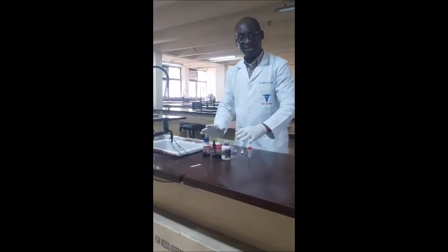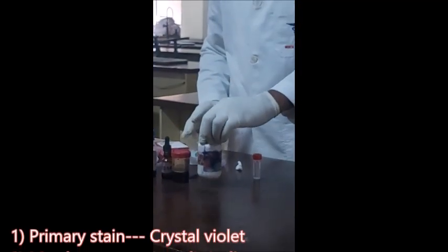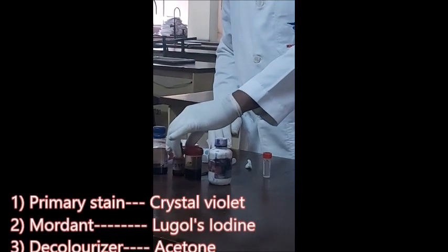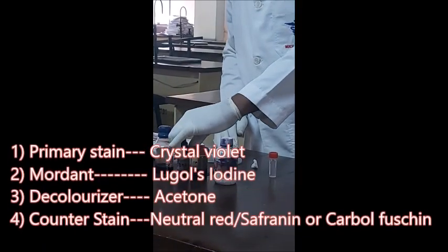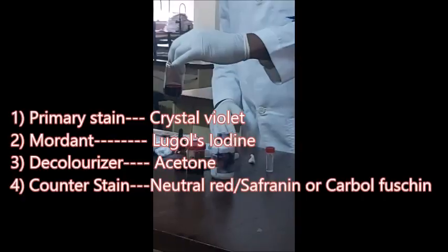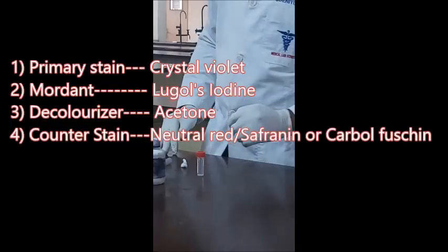The stains we are going to encounter in the Gram stain technique are: the primary stain, which is crystal violet; the mordant, which is Lugol's iodine; the decolorizer, which is acetone or alcohol-acetone; and the counterstain, which is a secondary stain — it can be neutral red, safranine, or 10% dilute carbol fuchsin.